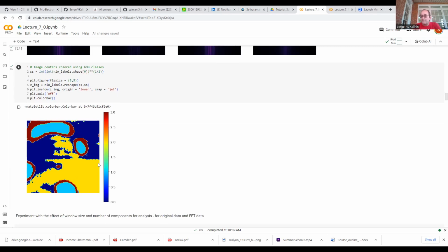The answer is very simple: machine learning analysis is a very powerful tool, but it's also a very blunt tool. If we tell our algorithm that we want to split our image into exactly 4 phases, it will do it no matter what. It will lock on the arbitrary small difference within the data, and basically it split it for us into 4 phases.